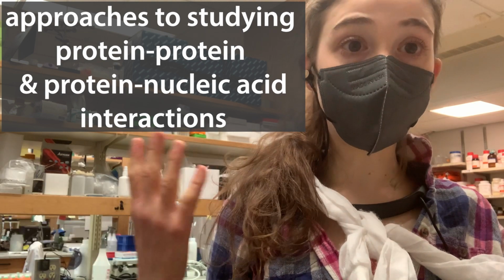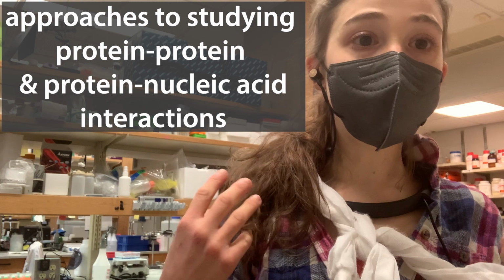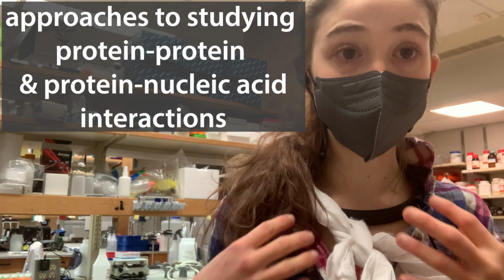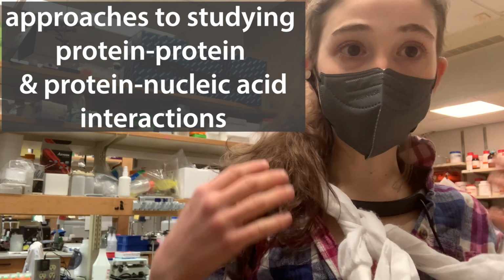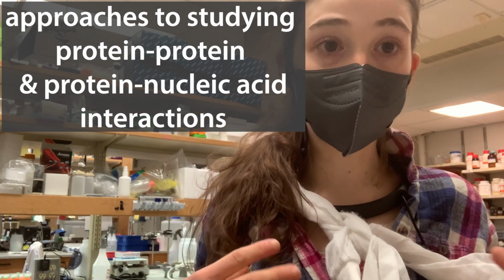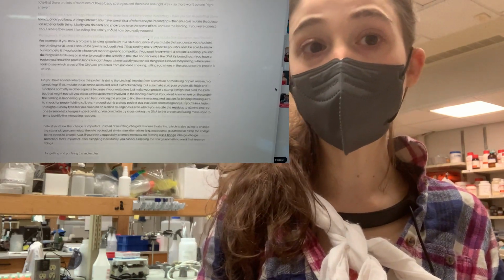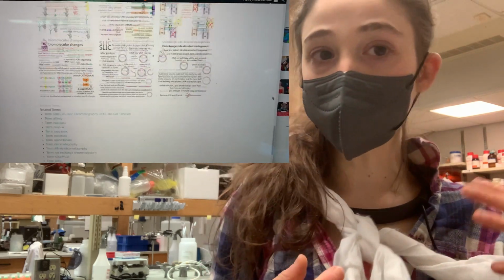A lot of my research involves studying protein-protein and protein-nucleic acid interactions. And so today I wanted to just go over some of the techniques that we use to address these type of questions and how you might go about approaching studying a protein-protein or protein-nucleic acid interaction. So thinking through some examples and that sort of thing. So it's going to be a more technical post, less background than usual.